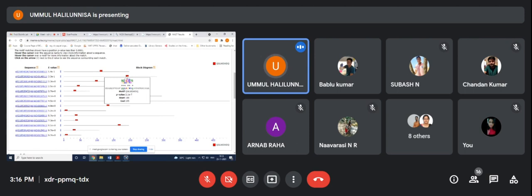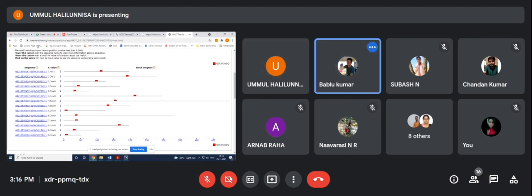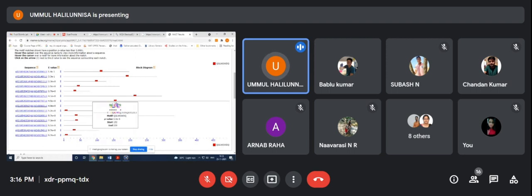Can you visualize that? So it is depending on the region. Yes, depending on the region, and you can see it is present here in 150 to 159, but it is present here in 95 to 102. The position may vary according to the species and its sequence length.